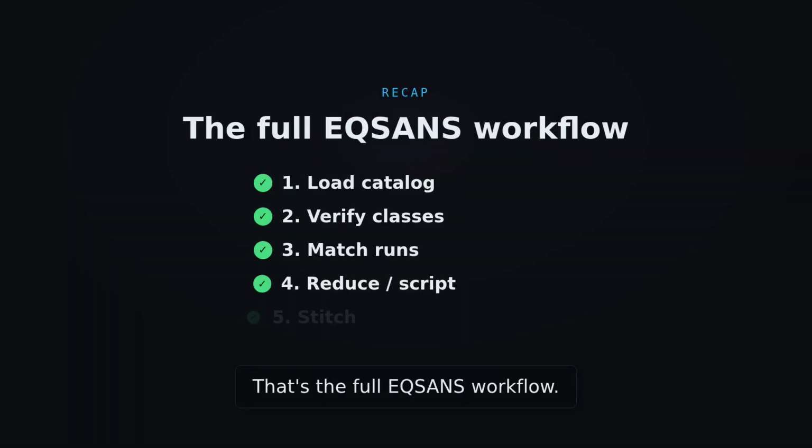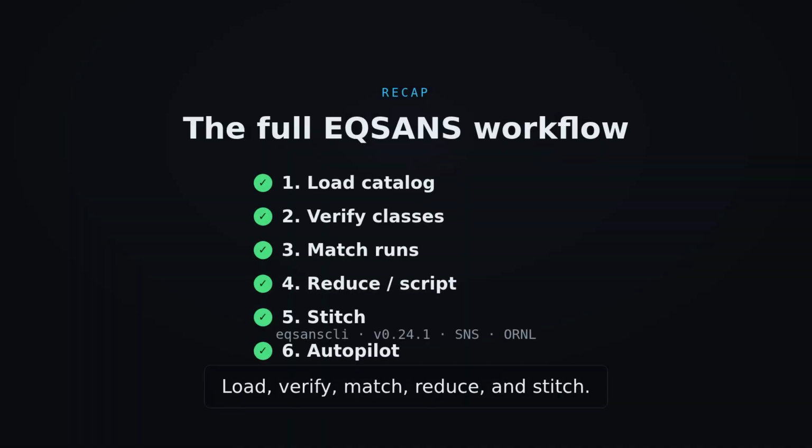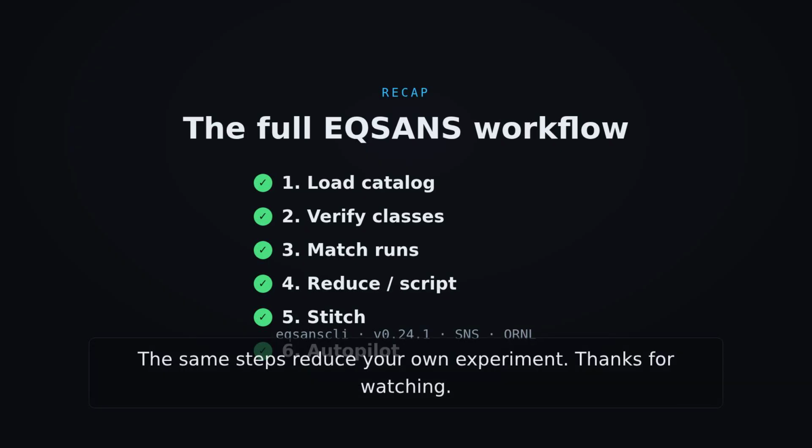That's the full EQ/SANS workflow. Load, verify, match, reduce, and stitch. By hand for control or autopilot for speed. IPTS 38603 was just our example. The same steps reduce your own experiment.